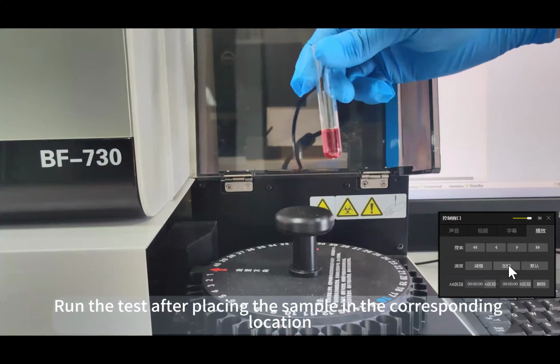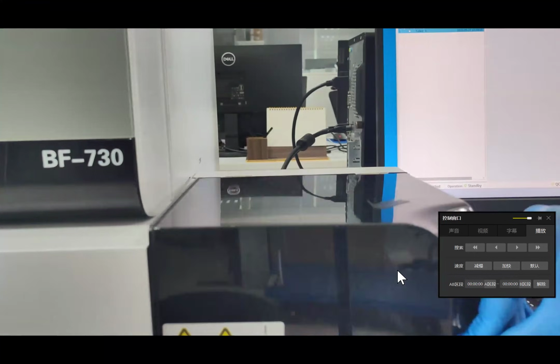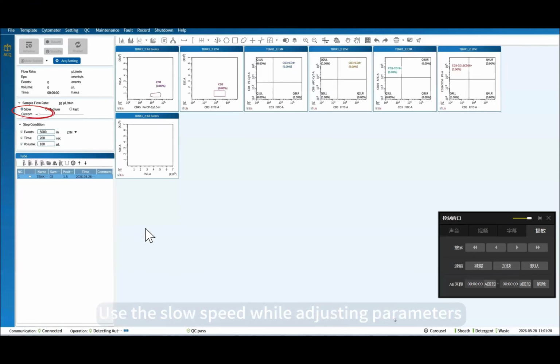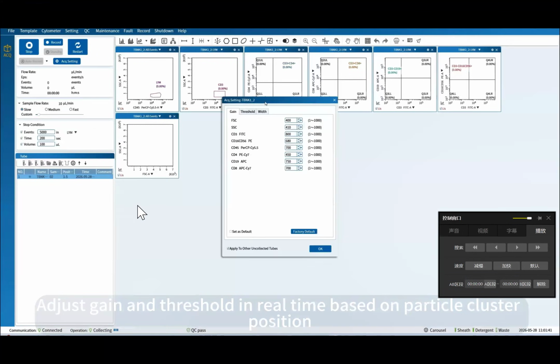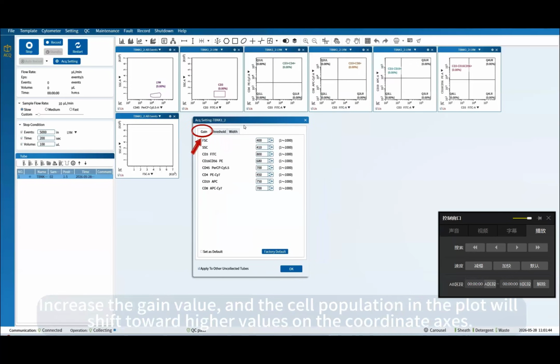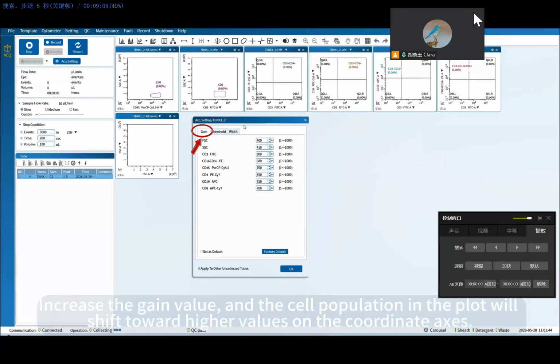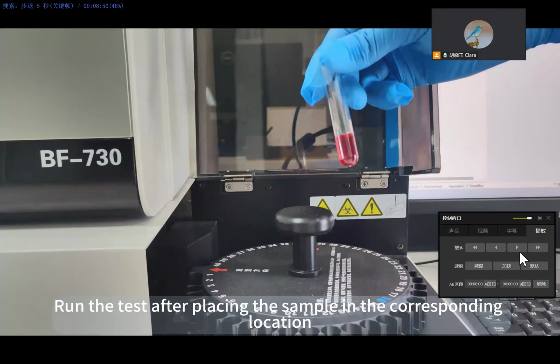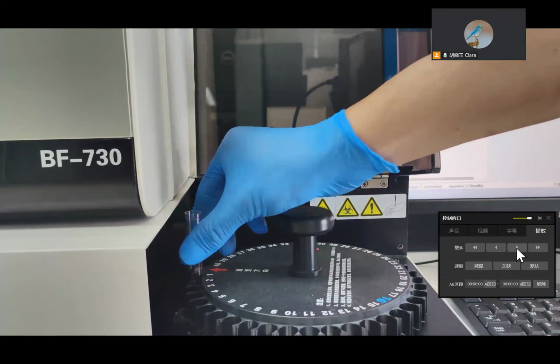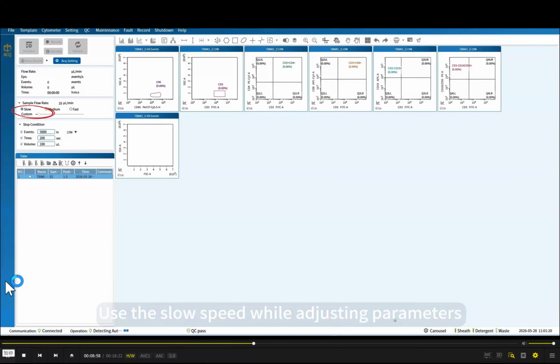Run the test after placing the sample in the corresponding location. Use the slow speed while adjusting parameters. Adjust gain and threshold in real time based on particle cluster position. Increase the gain value, and the cell population in the plot will shift toward higher values. Adjust gain and threshold in real time, placing the sample in the corresponding location.